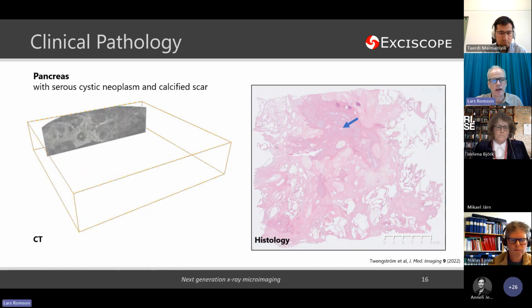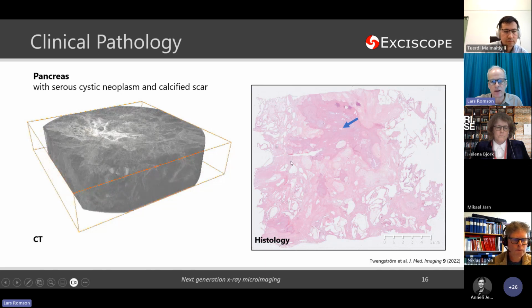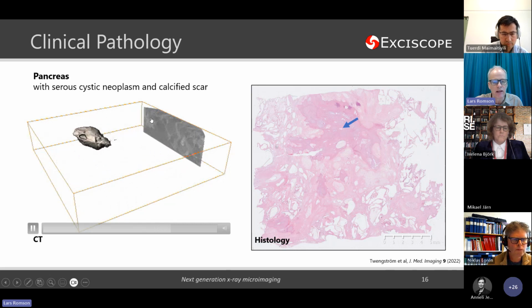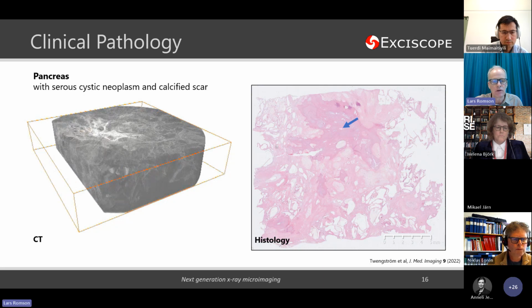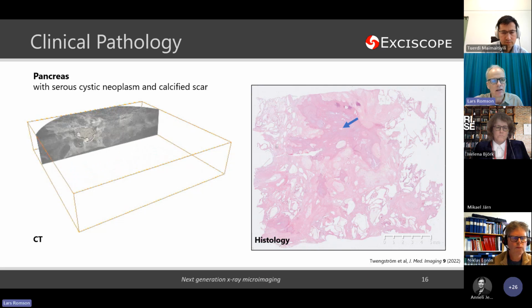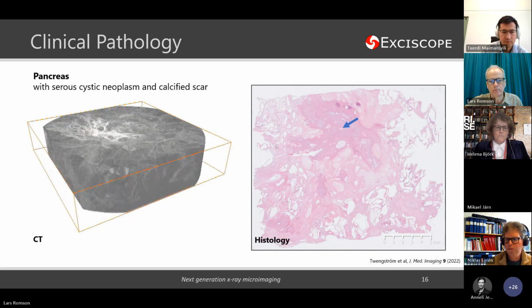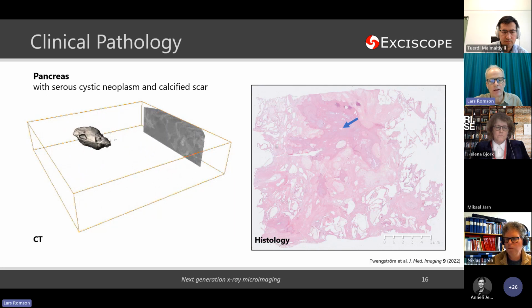And then if we can play this, this is actually the same puck with the same tissue, and it's just the slice has been taken from the top, and then we scan the rest. So we can see below what pathologists could see in the microscope. We could here see that there were more things below. This is a very interesting area, and there is a lot of research going on here.